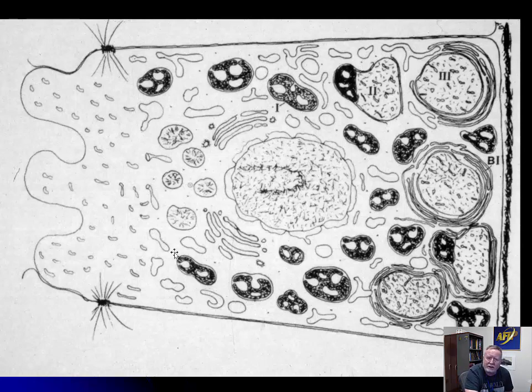And the changes in the mitochondria, which are now free floating around the cell, are changing from this low amplitude swelling to a diffuse swelling of the entire mitochondria. If this was one with low amplitude, look how big these have gotten. So you have a lot of fluid that's accumulating within. The cristae are breaking down, and you see an accumulation of these dark deposits of calcium. Calcium is a poison for mitochondria, and if you get too much, then they can't do their job.